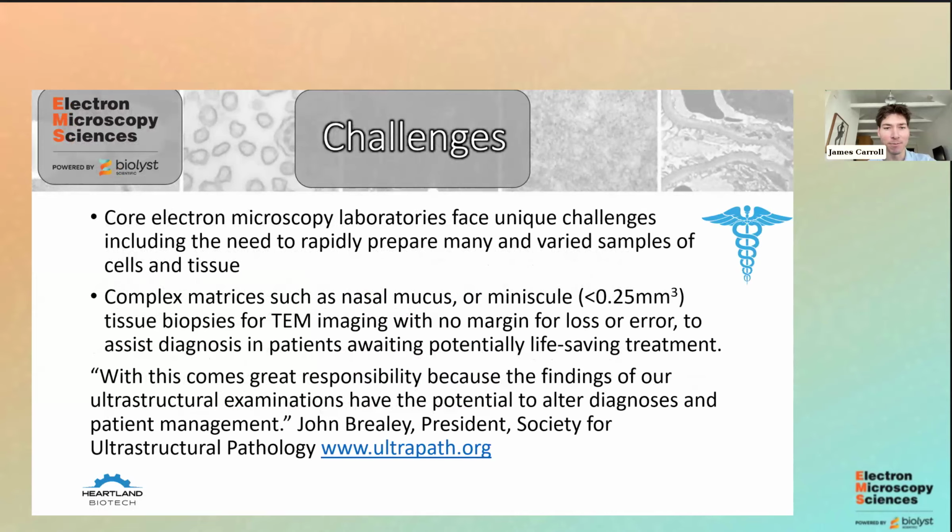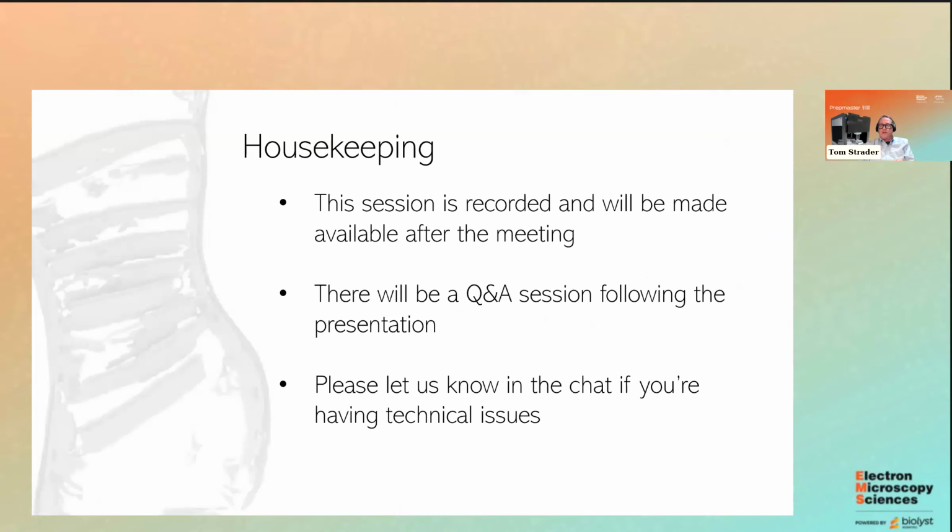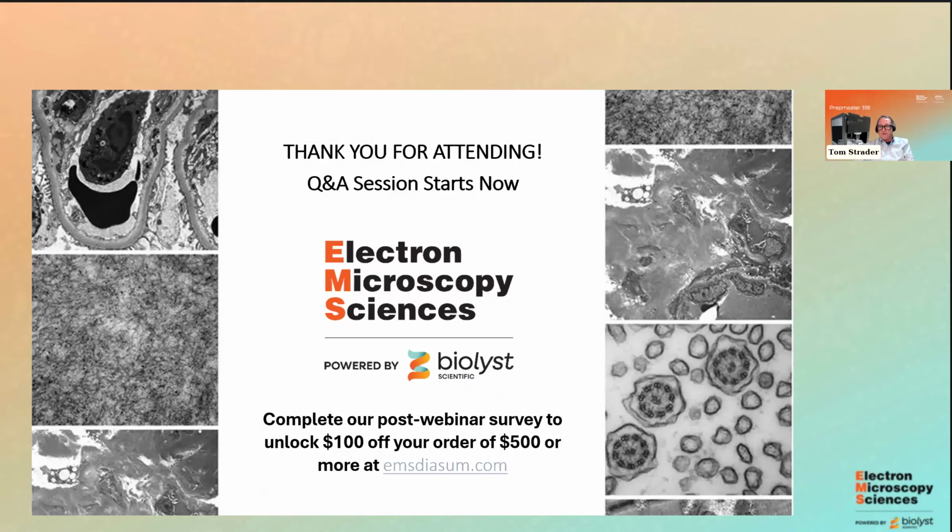Actually, James, I got one quickly if we can cover this. Something's always intriguing about your dehydration, Rob, which is acetonitrile. Everyone has done ethanol, and then people use acetone sometimes, and then transition solvents. How did you end up using acetonitrile?